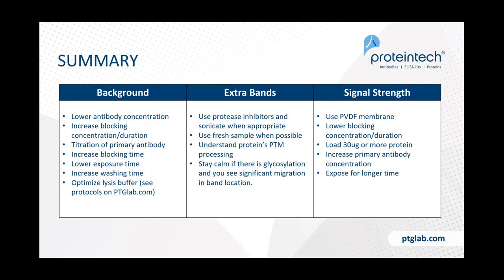Here is a summary of the main tweaks and levers discussed. For background: lower antibody concentration, increase blocking concentration and duration, titrate your primary antibody, increase blocking time, lower exposure time, increase washing, and optimize your lysis buffer. For extra bands: use protease inhibitors, sonicate when appropriate, use fresh samples, understand the protein's post-translational modifications using UniProt, and stay calm about glycosylation causing migration shifts from the predicted molecular weight. For signal strength issues: use PVDF membrane, consider lowering blocking concentration and duration, load 30 micrograms or more of protein, increase primary antibody concentration, and use a longer exposure time.